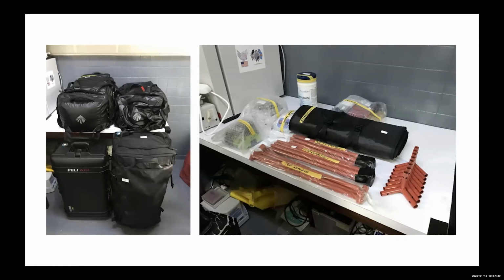Before SARS-CoV-2, this was an important element of the work that we did. We haven't been able to do any field trips in the last 2 years, but this is the ARTIC mobile lab setup that we developed, and it's a 3-cabinet system which packs up into these bags. This was taken in INRB in Kinshasa. This photo, all very neat because it was packed up by Ian Goodfellow, who's absolutely OCD about packing, all labelled.